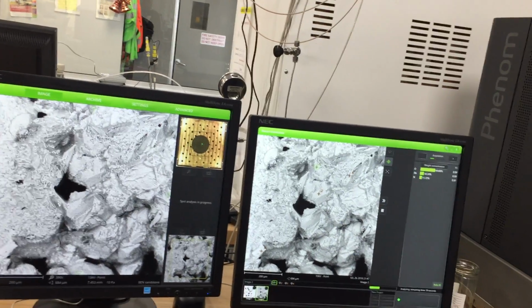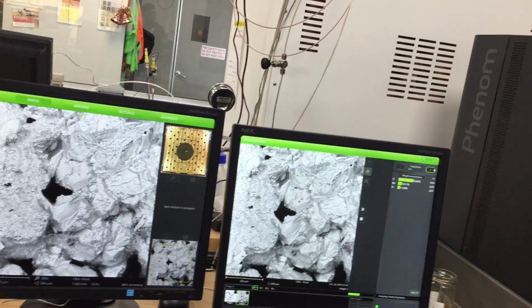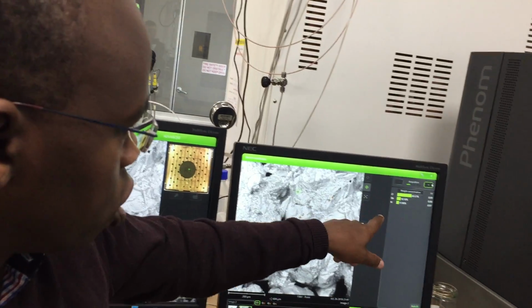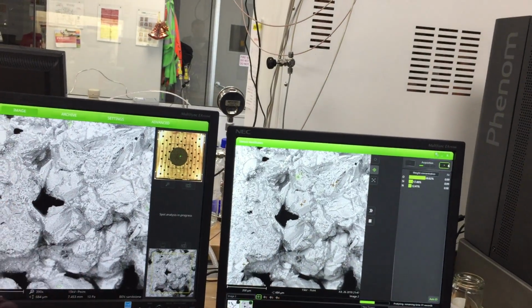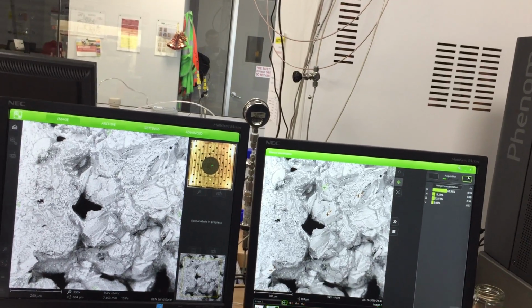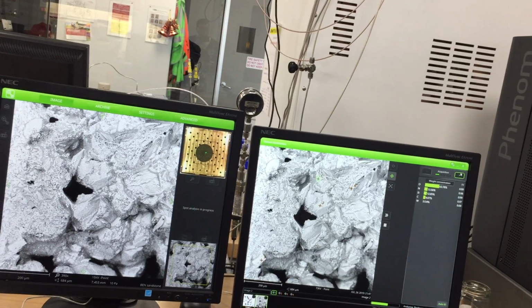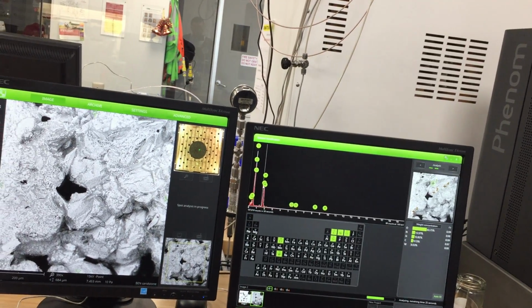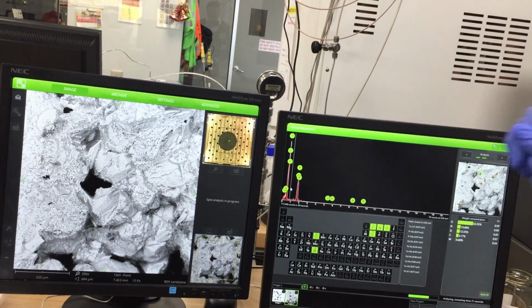So finally it gives you average results from the 4-point data. In that spot, it tells you we have all these elements. If you want to do an average, you will have to manage it yourself. You have to edit, because it will create a report and you can just manually go and edit. So the second page is to look at the actual EDS spectrum and make sure the spectrum is actually correct.